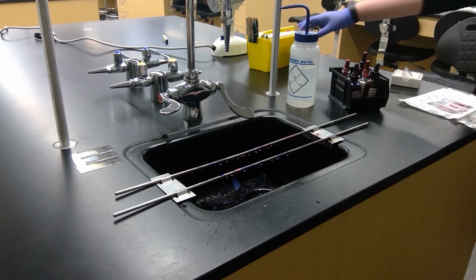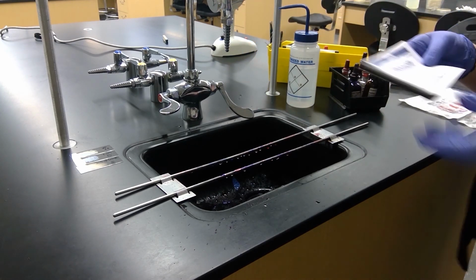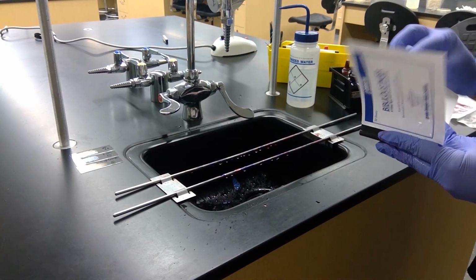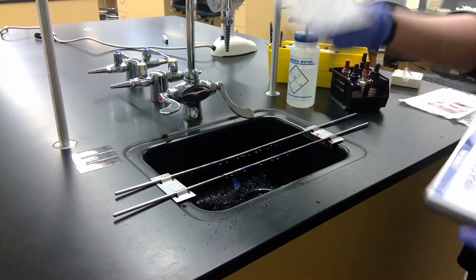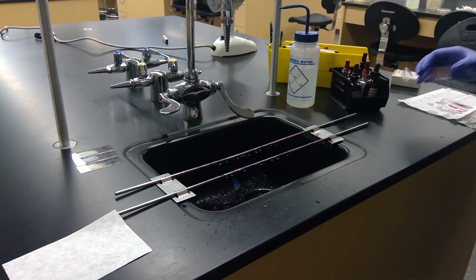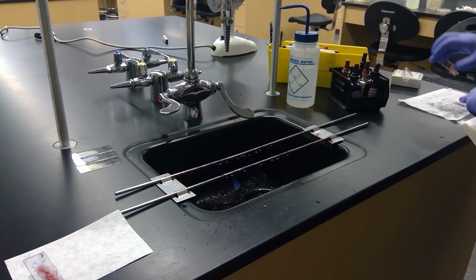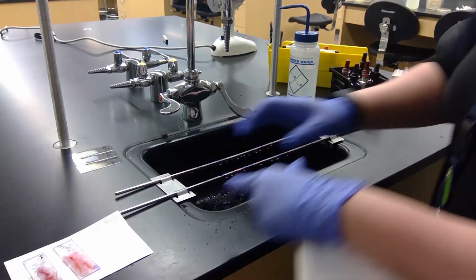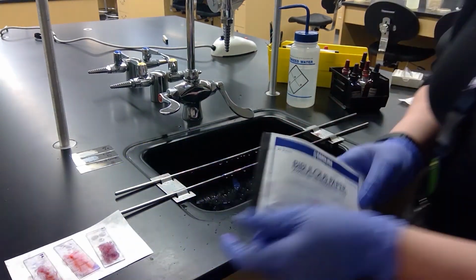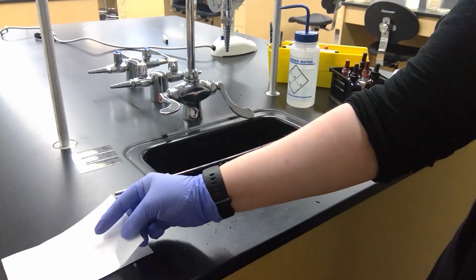So we'll grab some bibulous paper, which looks like this. And we'll just place our slides on it. Dry. And then we'll put another one on top.